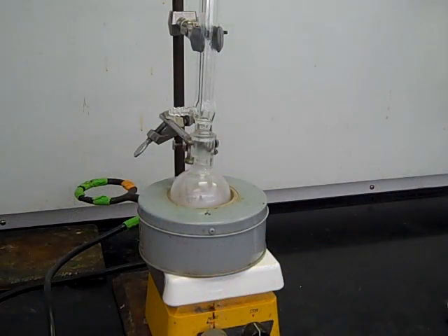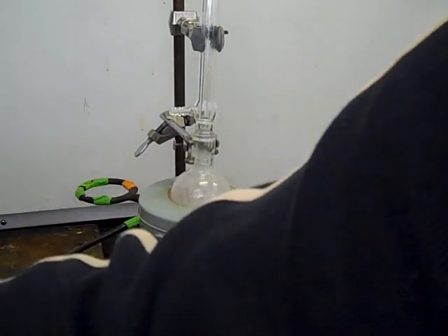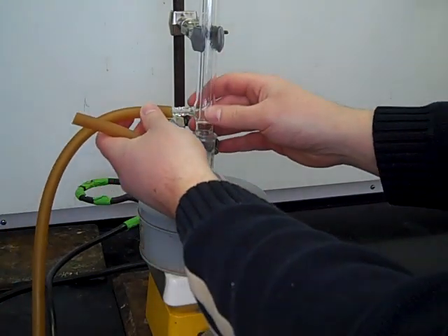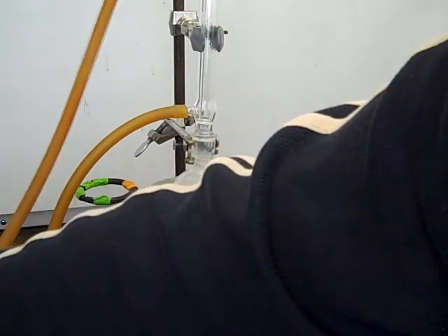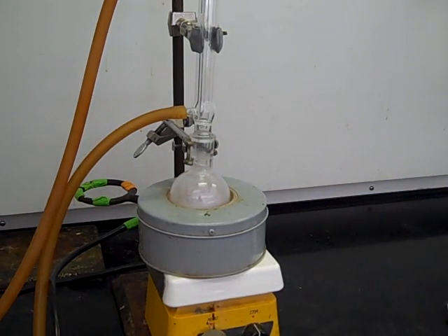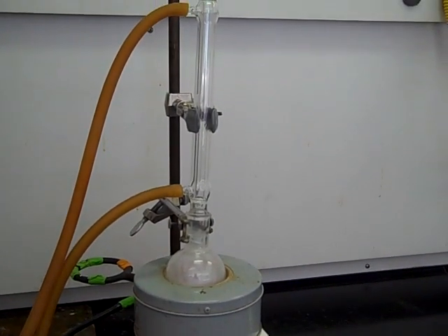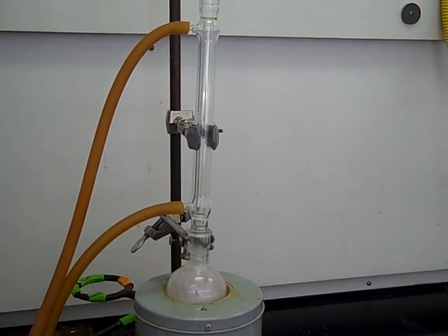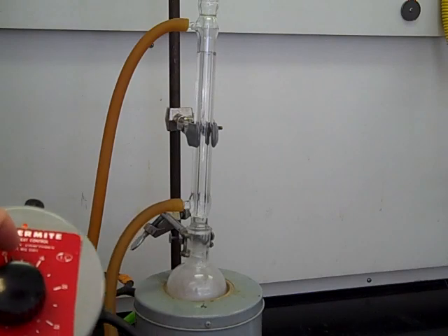Now that it's clamped down, we need to hook up the water hoses. The water hose from the wall comes into the bottom of your condenser and then goes out from the top to the drain — make sure you have that set up. Once you've got that, turn on the water at the wall. You don't need the water on too hard, just enough to keep water flowing steadily through the condenser. Then you can start heating by turning on the power mite and letting your reaction heat up.